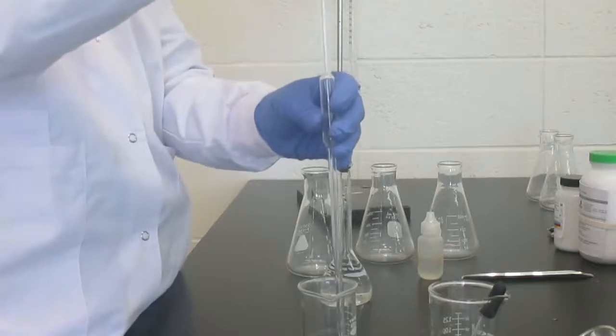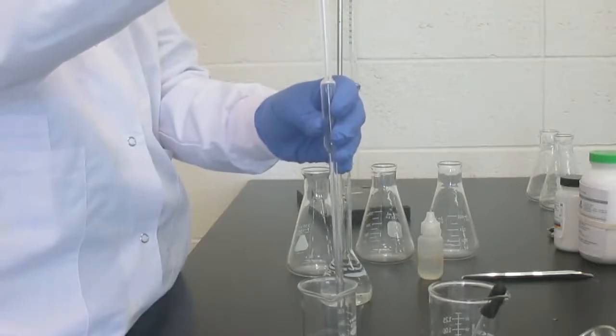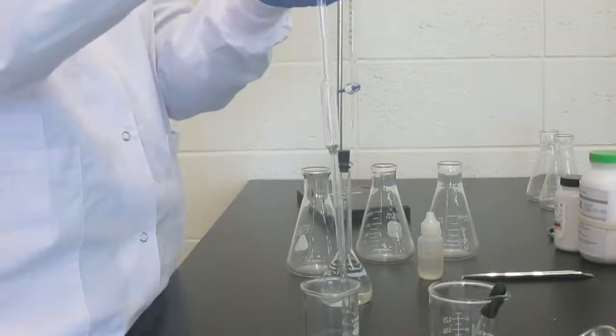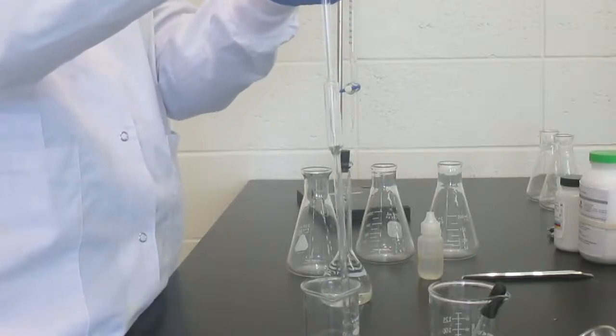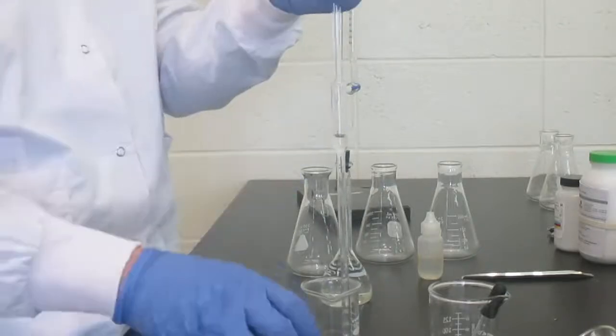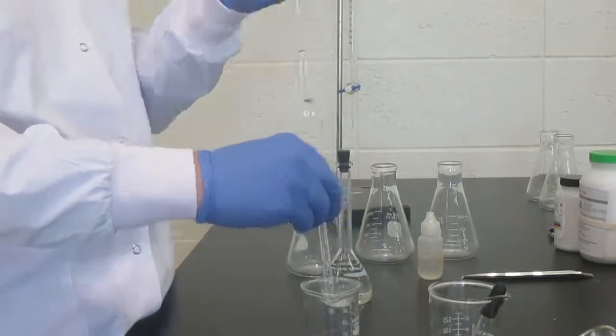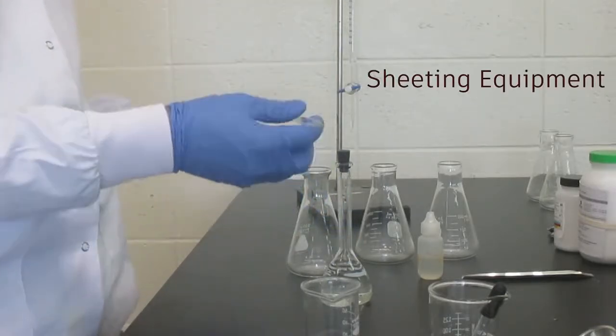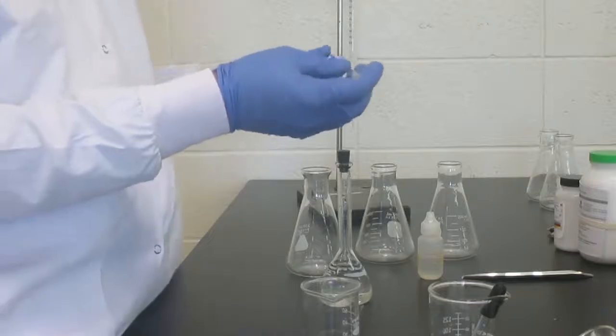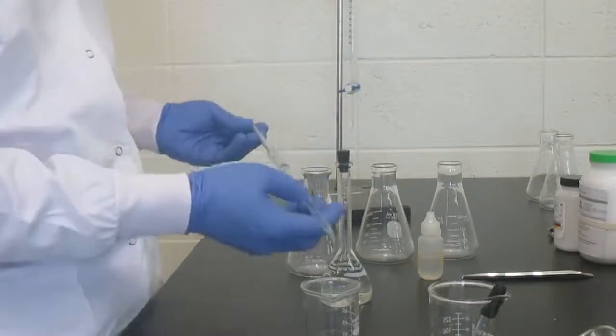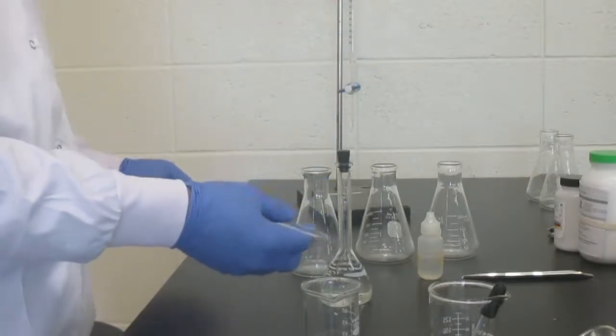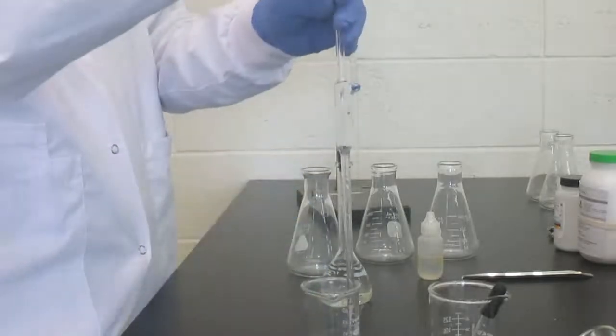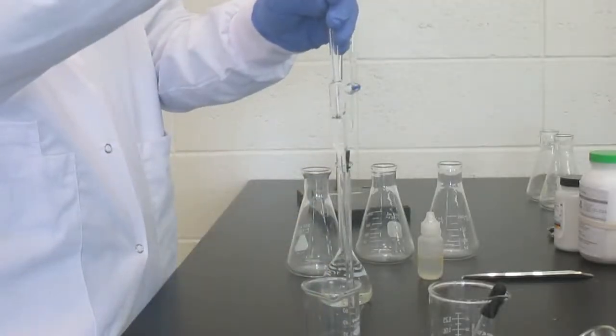I am going to start with getting this pipette about a third or halfway full with some KHP. We are doing what is called sheeting. I'm going to roll around this half full pipette and I'm going to cover the inside with KHP. As a matter of fact, I'm going to pull it even higher, all the way up to the line so that I can get that coated.